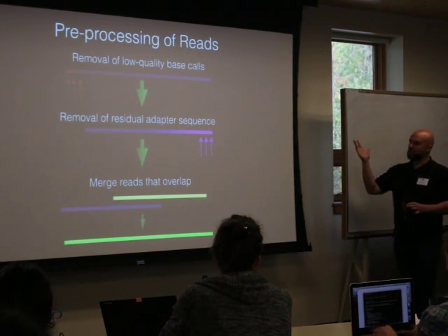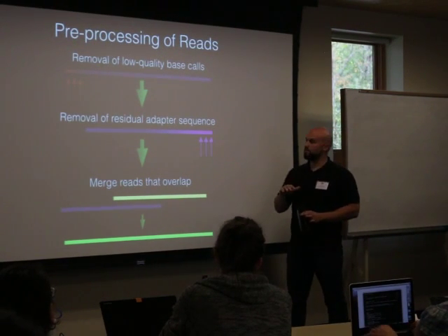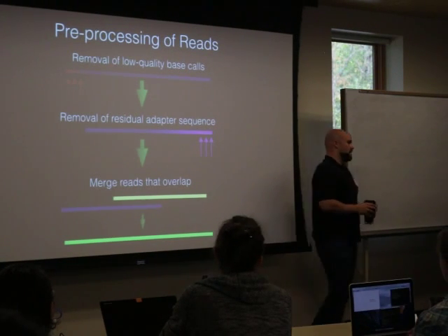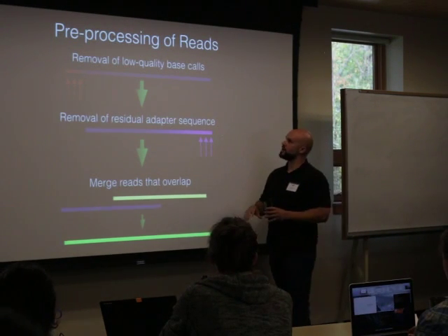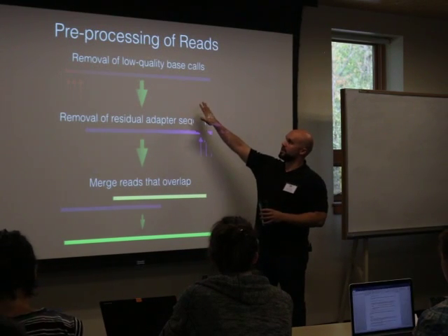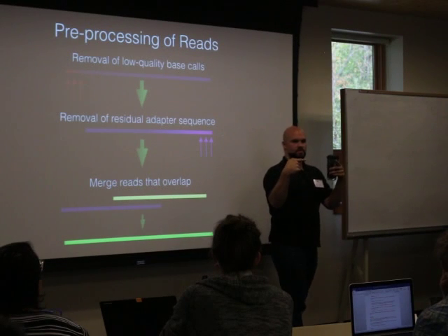But there are a variety of approaches to do this, and I talk about it briefly in the introduction to the worksheet. One of my collaborators, Matt Settles, who's at University of California, Davis, has pioneered a pretty good cleaning pipeline. I think it's pretty rock solid and it's fundamentally sound. But basically the way that it works is that you go through and first identify low quality base calls from all of your reads, and you can actually just chop those off.